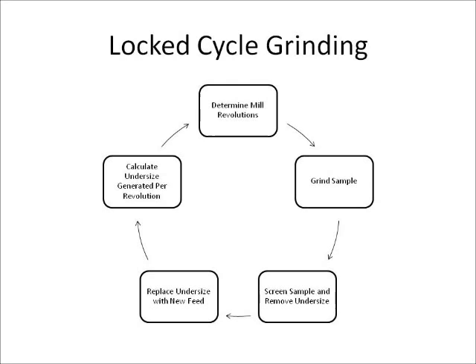Why 250%? It is believed that when the test was developed, a 250% circulating load was the most common circulating load in the industry. If a different circulating load is to be used during commercial grinding, the test should be conducted using the circulating load expected during commercial grinding. The test is run for a minimum of 5 cycles or until equilibrium is reached.